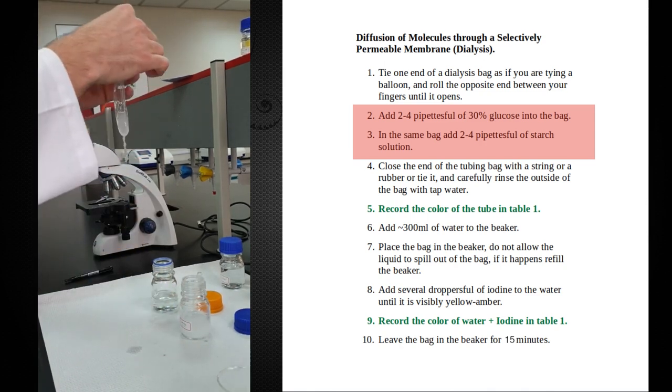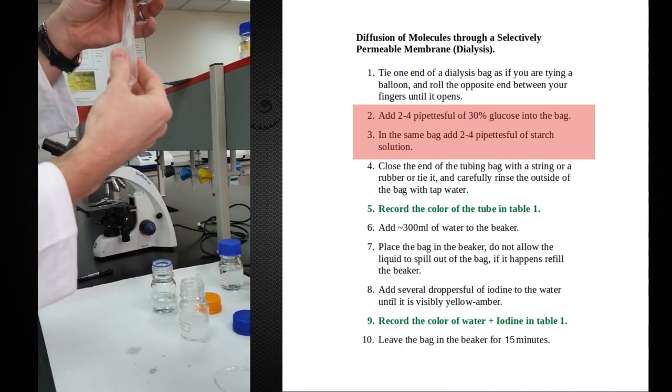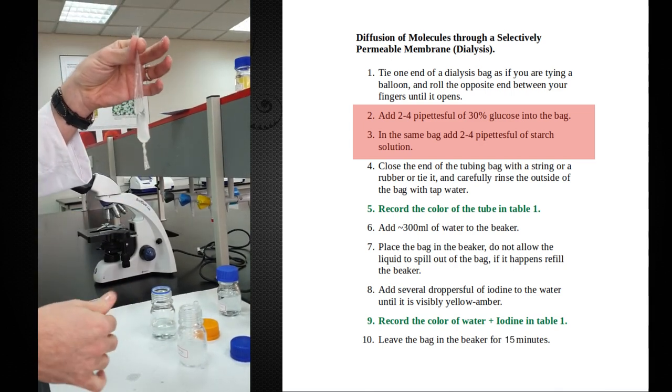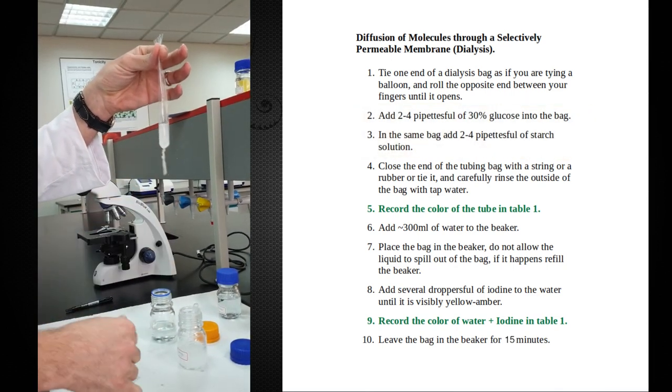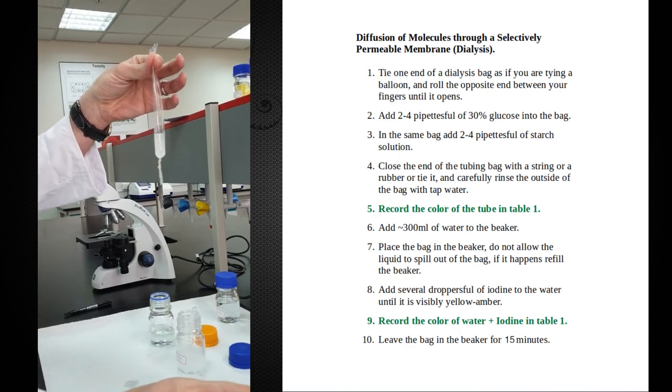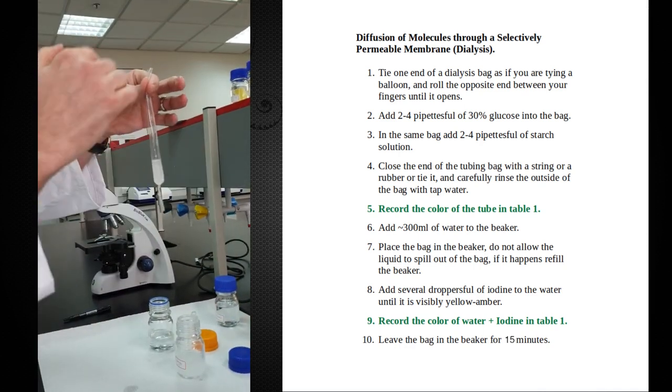This is going to be my glucose. I'm just going to put three pipetfuls in there. Now we have our sample inside. I'm just going to mix it up a little bit.